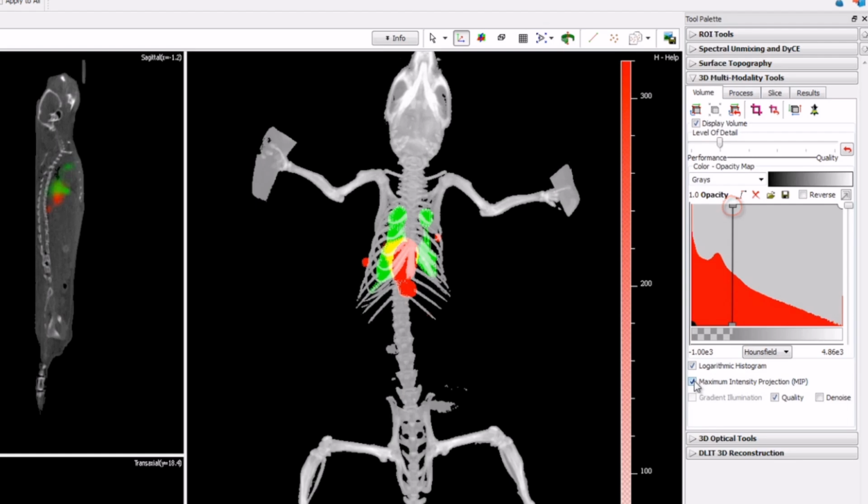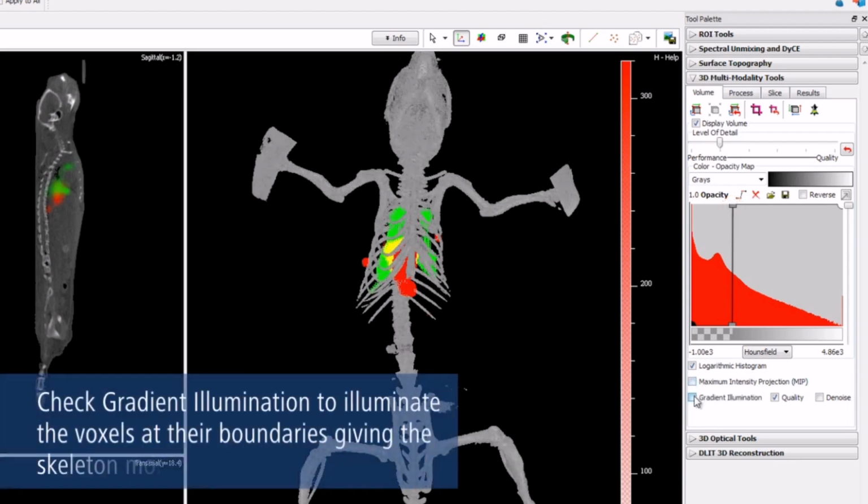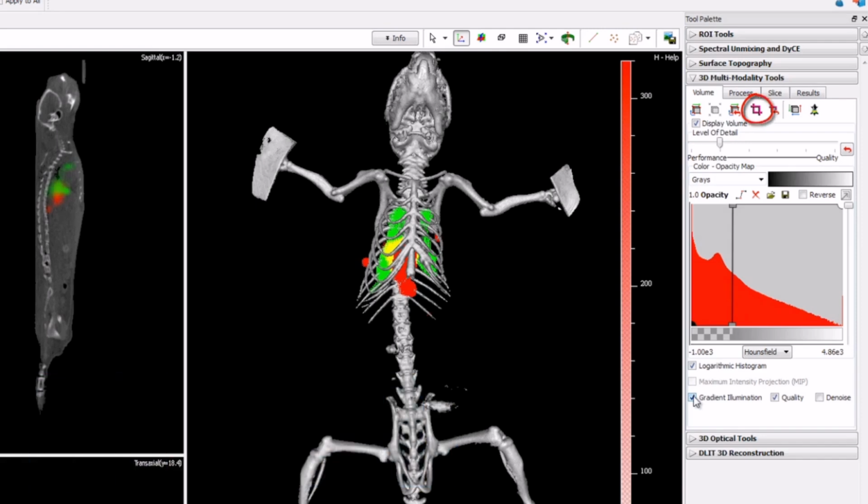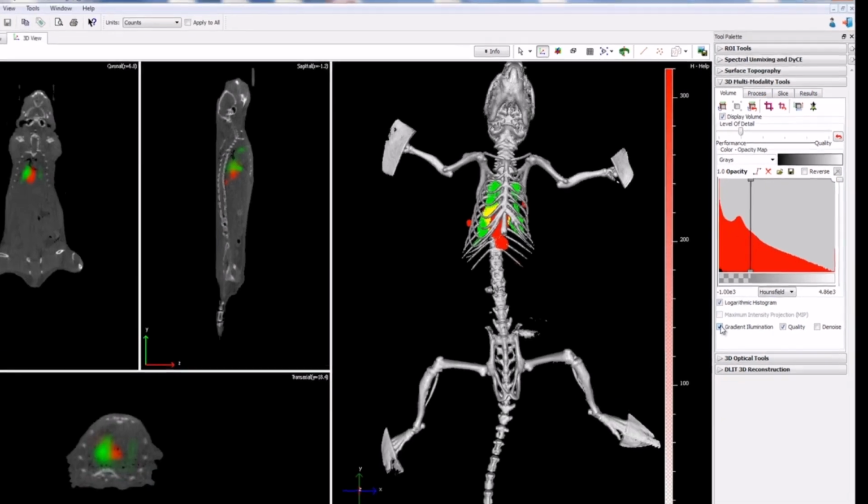You can also crop the image and adjust the opacity with the provided slider. Under certain conditions, even more advanced organ segmentation can be done using the CT data. For more information on how to do this, please contact one of our advanced imaging training specialists.